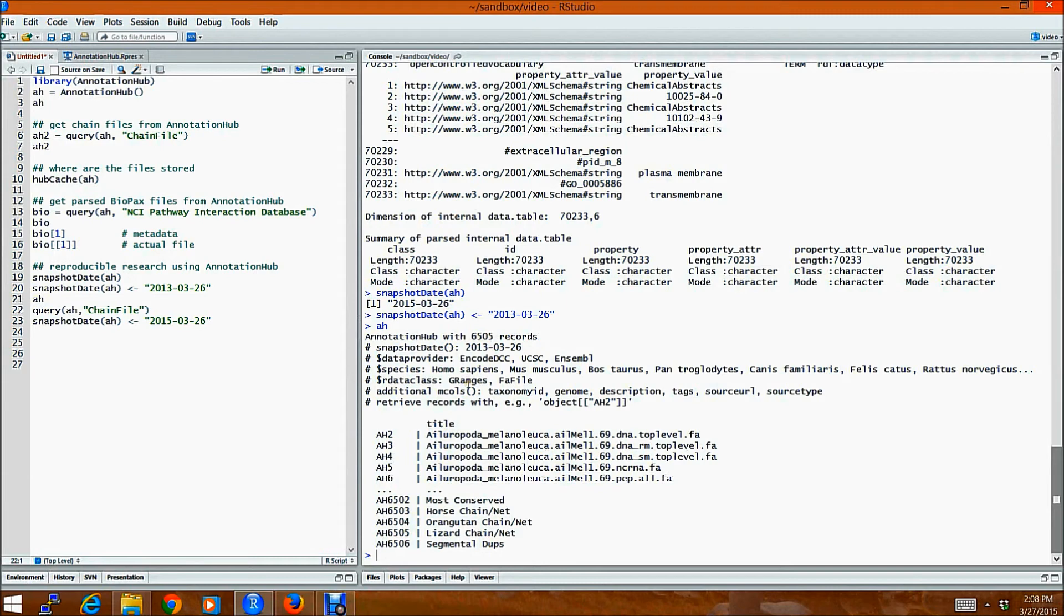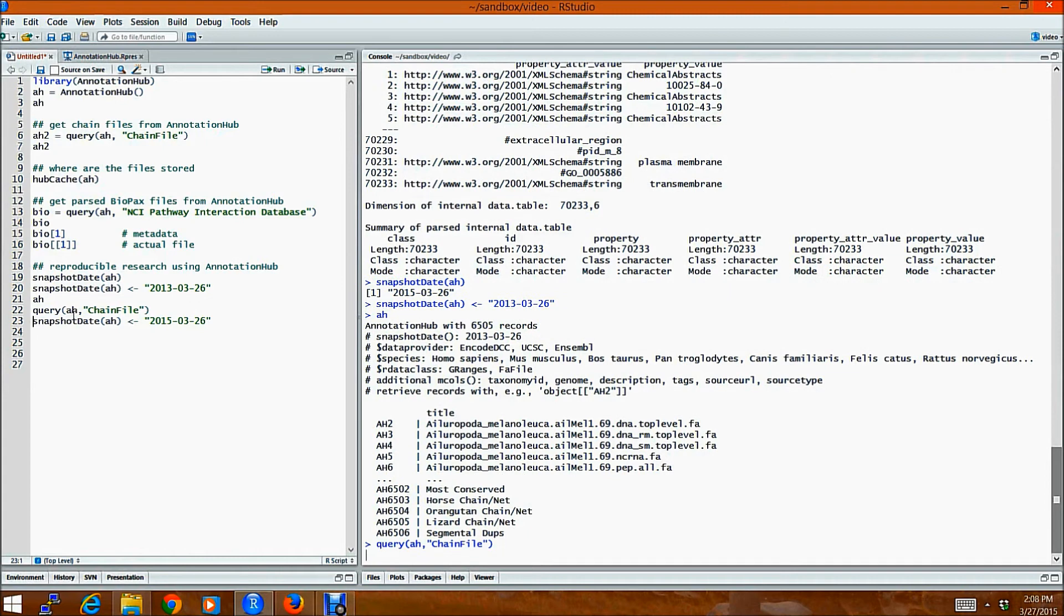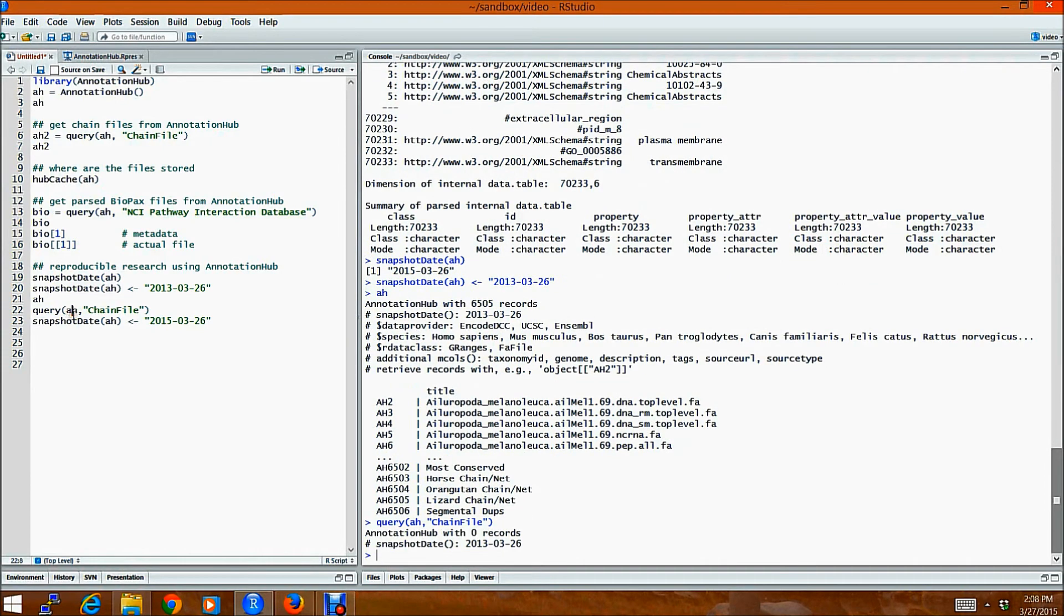And I know for a fact that chain files were not added to AnnotationHub two years ago. So today, so for two years ago, if I query AnnotationHub, I should not get those files. And as you can see, AnnotationHub comes back with zero records.